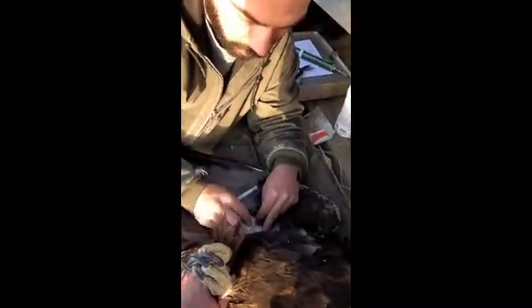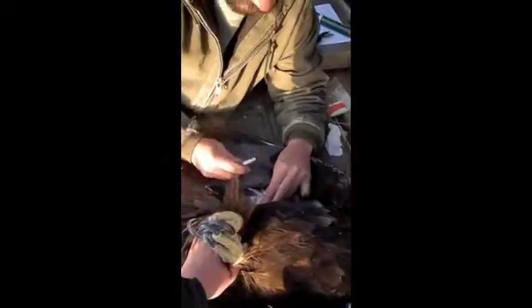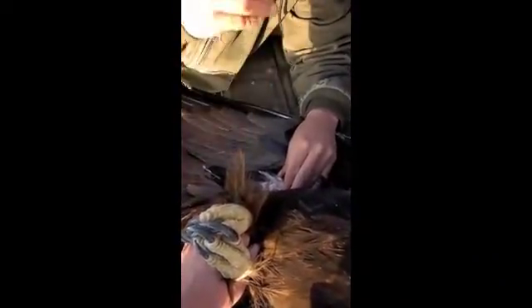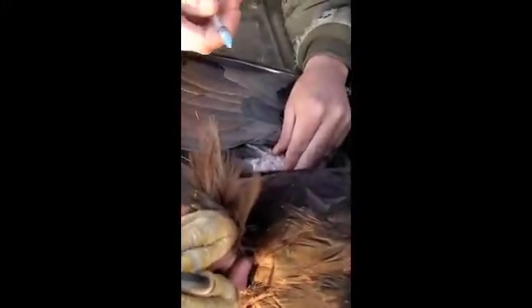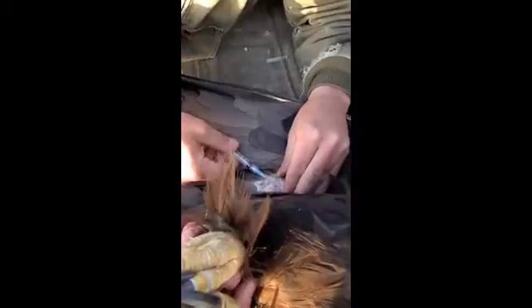So here we're going to take some blood. This is the brachial vein — it's the same vein that you get blood drawn from. We're going to use this to test to make sure we know for positive it's a male. Also, we're going to test for heavy metals, lead poisoning, mercury, as well as other contaminants. And then keep a DNA sample on file.